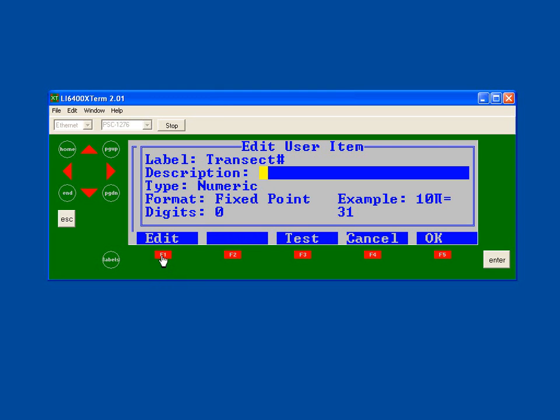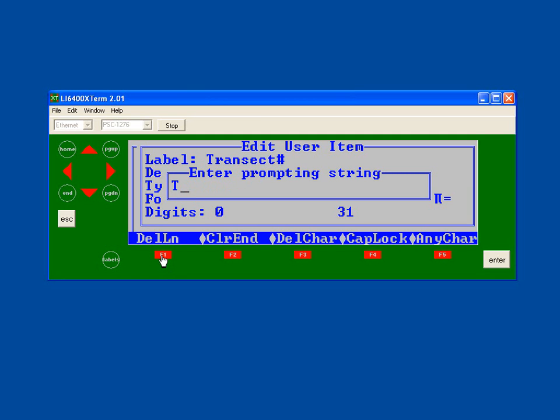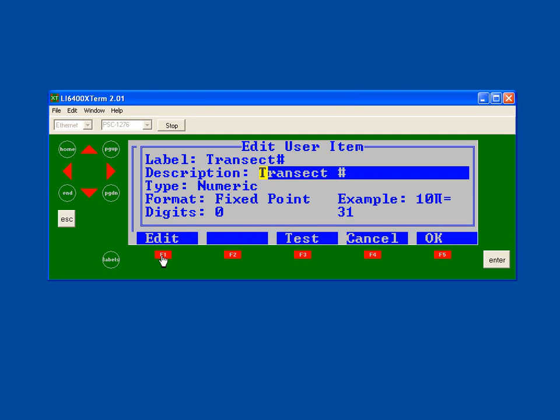The description, you can enter information if you would like. The description information is used whenever a complete list of all of the variables are displayed. For instance, there's a key in new measurements called what's what, and if you press that key, the label and the description for every parameter in the instrument comes up. So that would be when this particular information would come up.